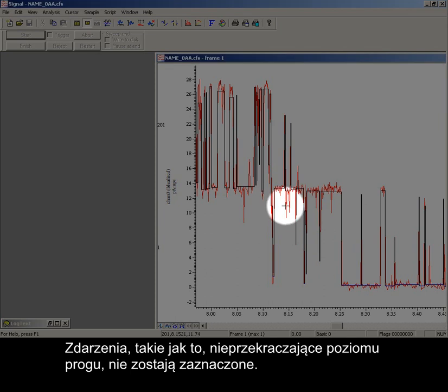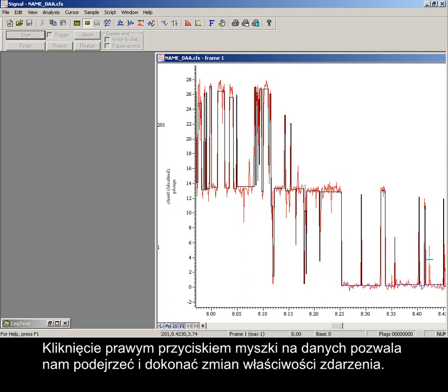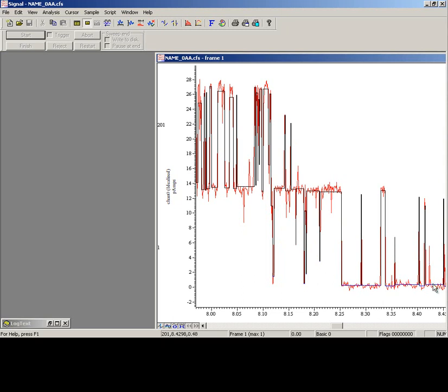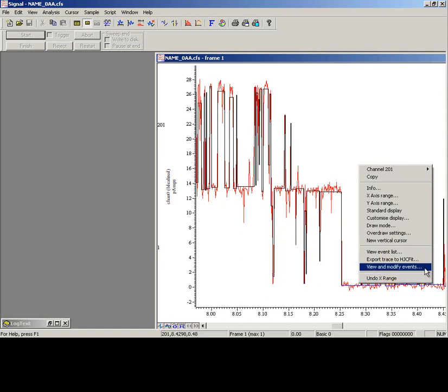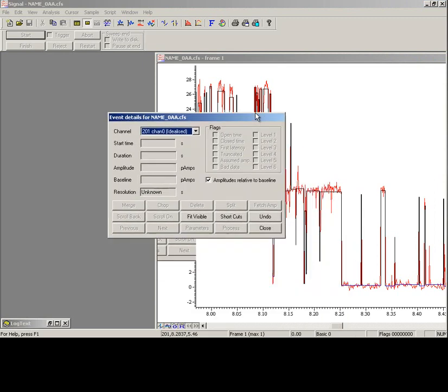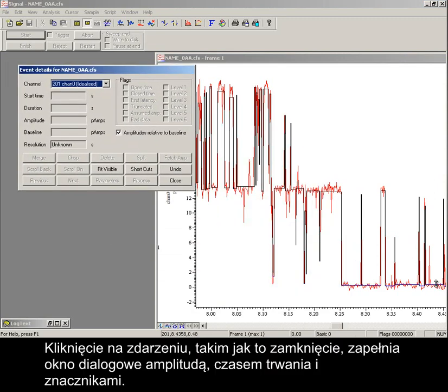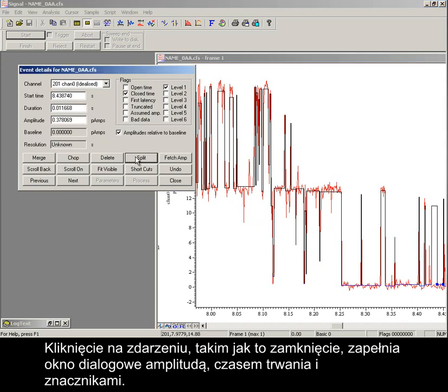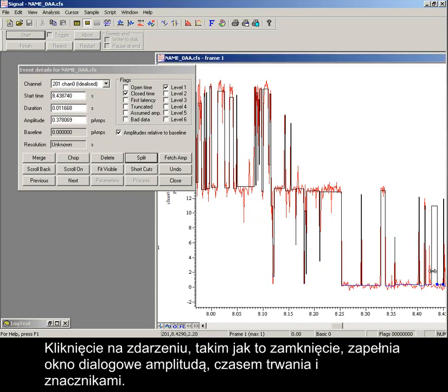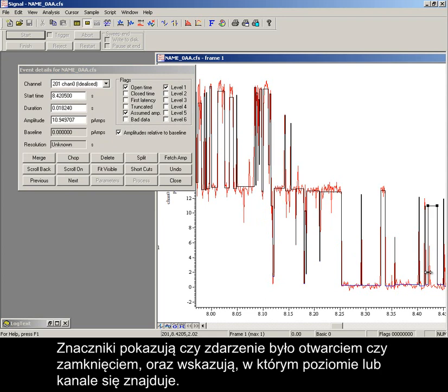Events such as these, which did not exceed the threshold levels, are not marked. Right-clicking on the data enables us to view and edit event properties. Clicking on an event, such as this closed level, populates the dialog with the event's amplitude, duration and flags. Flags show whether the event was open or closed, as well as indicating which level, or channel, it exists in.